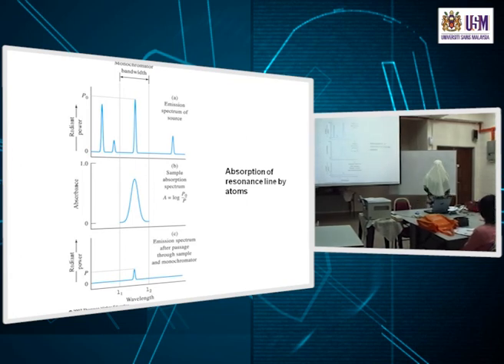Maybe it's important to get our reference right in terms of what we are looking at now. We have your source. We just want to look at your monochromator, I suppose, which slit.